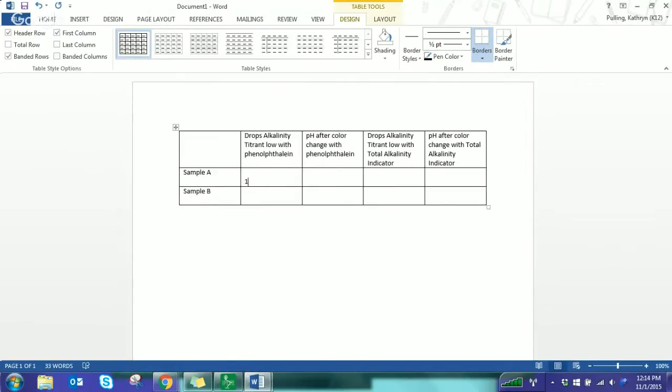And this time I'm a little bit lighter than the time before. All right, so I at least know for sure that since I can't do less than 1 drop, 1 drop's definitely getting me past 8.3. So more acidic than 8.3, and that's why I'm seeing the color change. Okay.